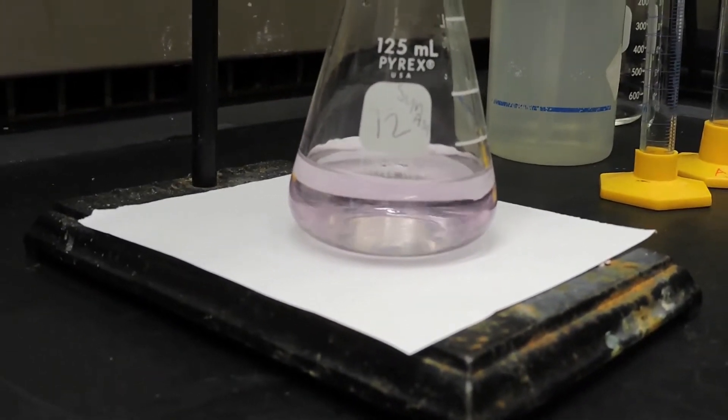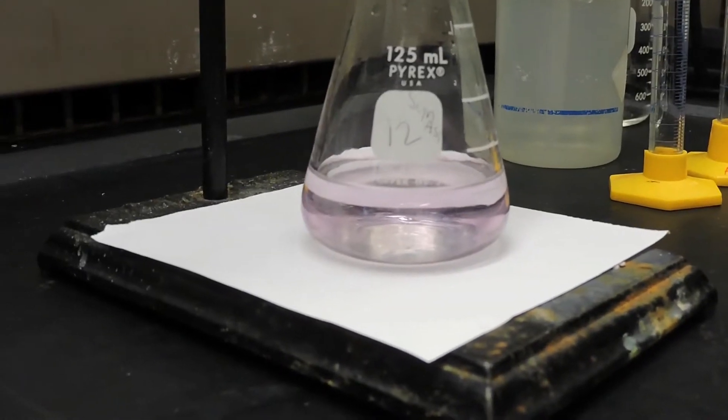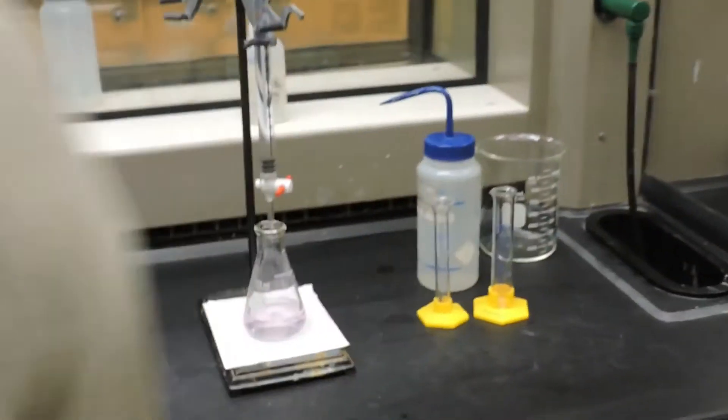Here we have a nice light pink color from the phenolphthalein indicator, indicating the aspirin has been fully titrated. The final volume in the burette of the sodium hydroxide solution is 13.5 milliliters.